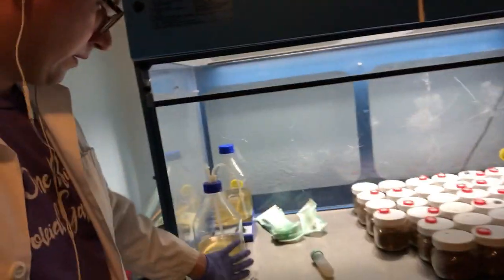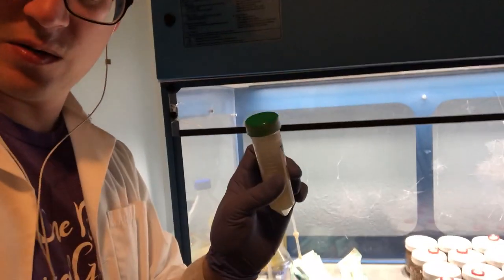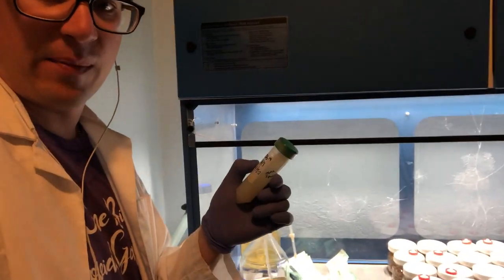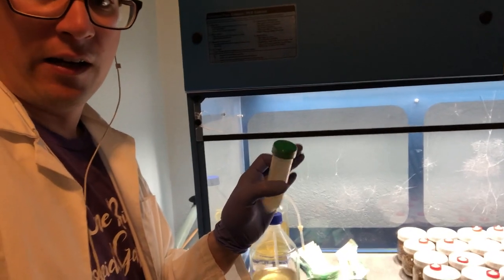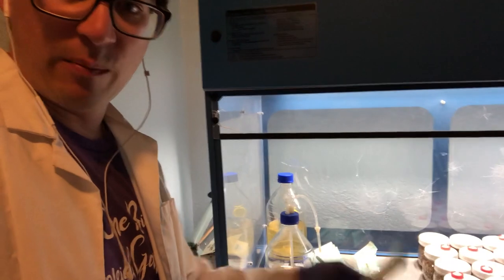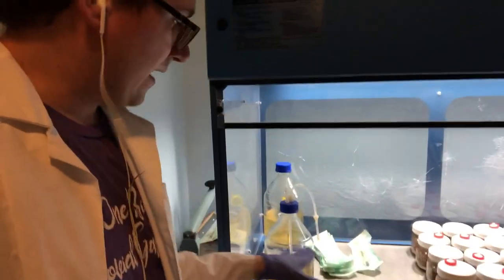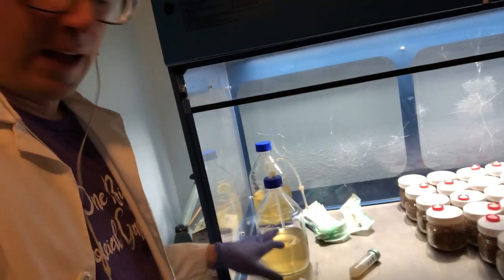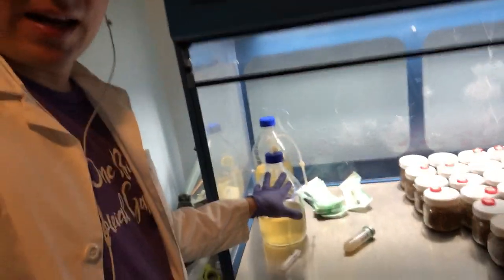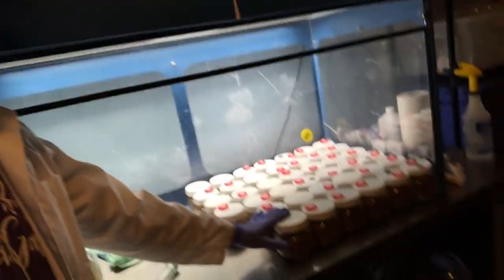I'll come back in a couple days and show you inoculating our cordyceps, which I like to use slants for because cordyceps degrade very quickly. In about 2 or 3 generations, they'll start to get mutated. So it's really important to keep your cordyceps on slants. I'll go from my slant directly into my liquid culture, and then I'll use this media extractor to inoculate a number of jars like this very quickly.